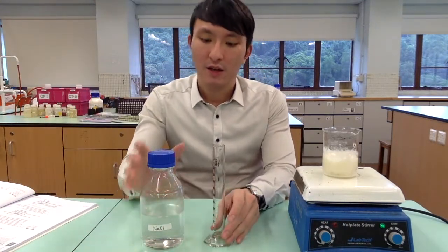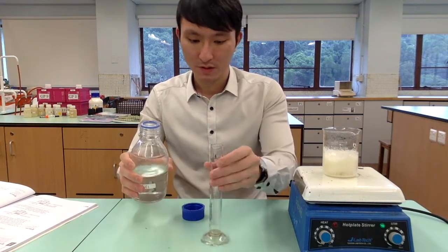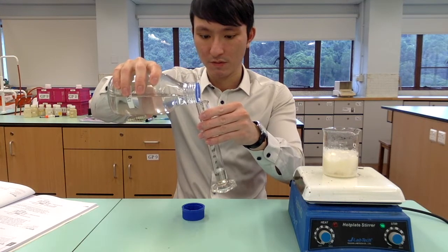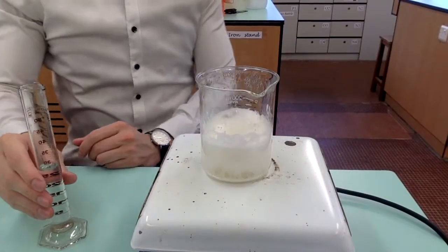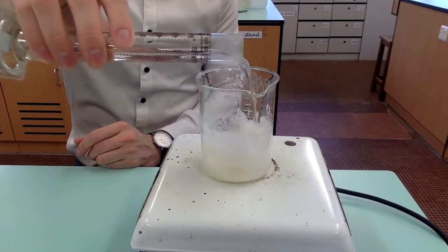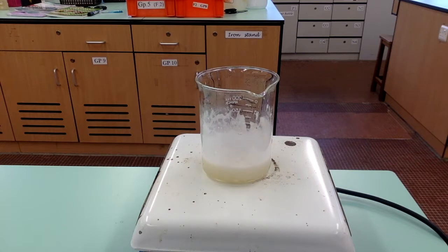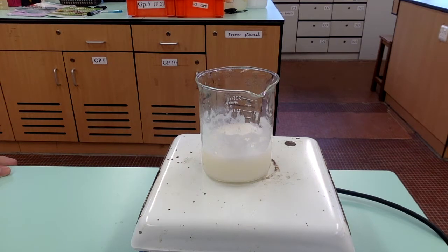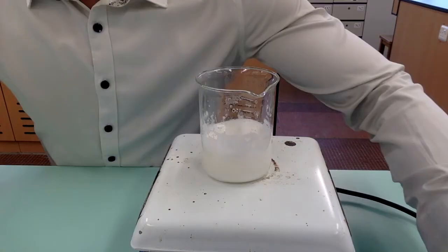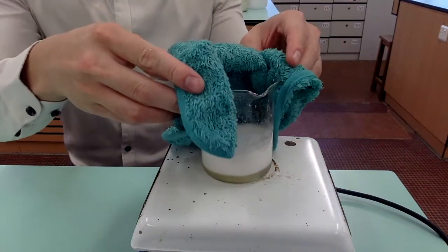And now I'm going to measure 30 cm cube of saturated sodium chloride solution. Using a wet towel to hold the beaker, remove it from the hot plate.